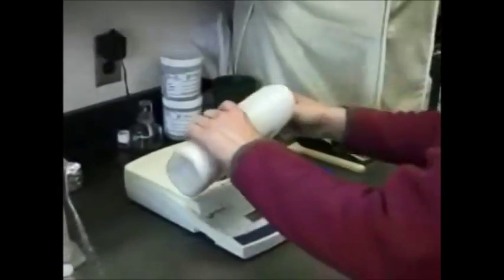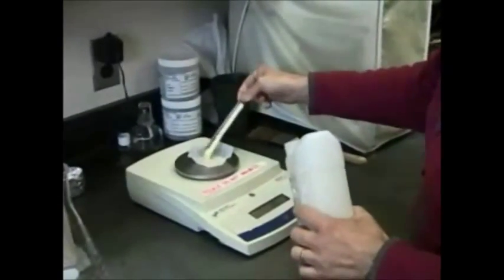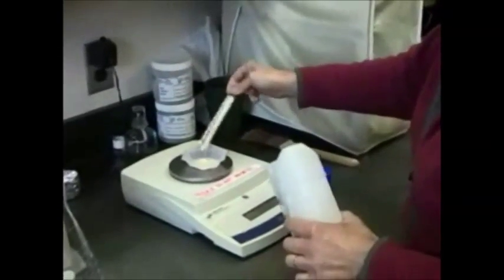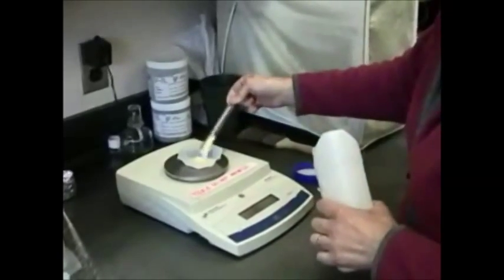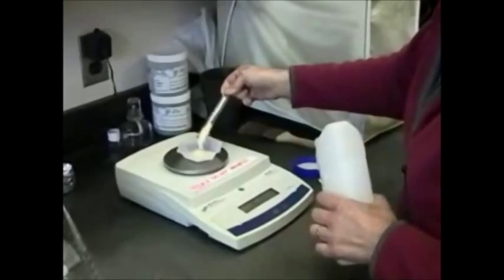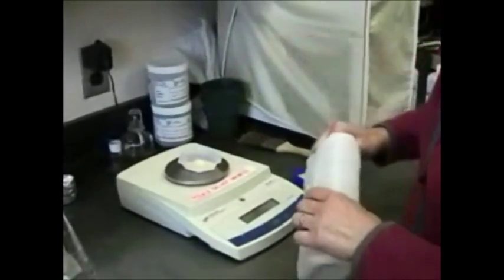First we've got to weigh out the ingredients. Fortunately for us, cornmeal agar comes in a dehydrated powder that has an extract from ground up corn and it's also got the agar already incorporated. So we're going to weigh out how many grams, Calla? Well, this is a half liter, so just 8.5 grams.